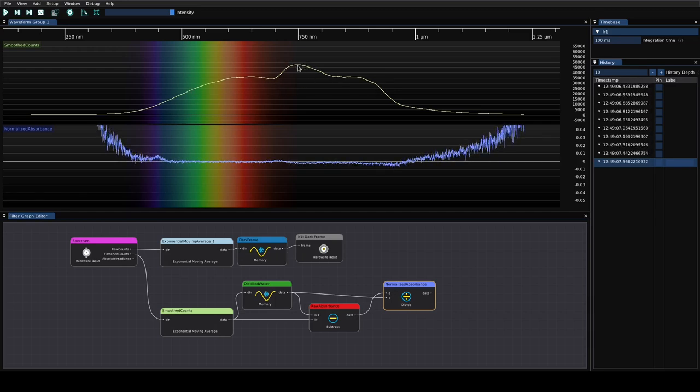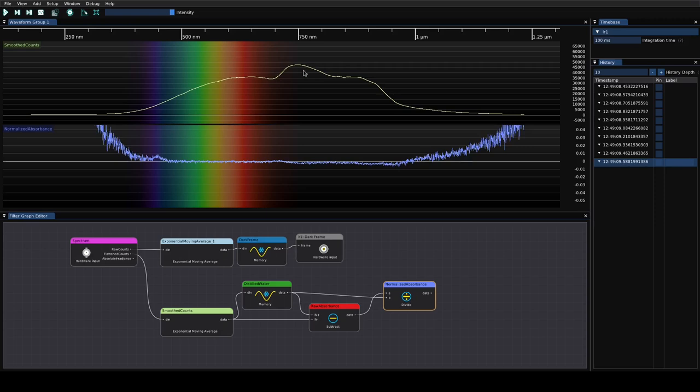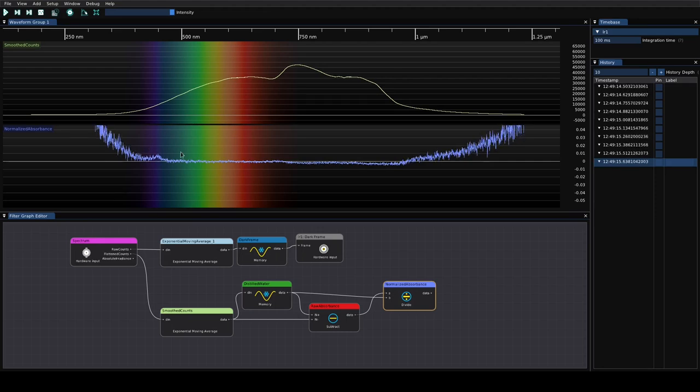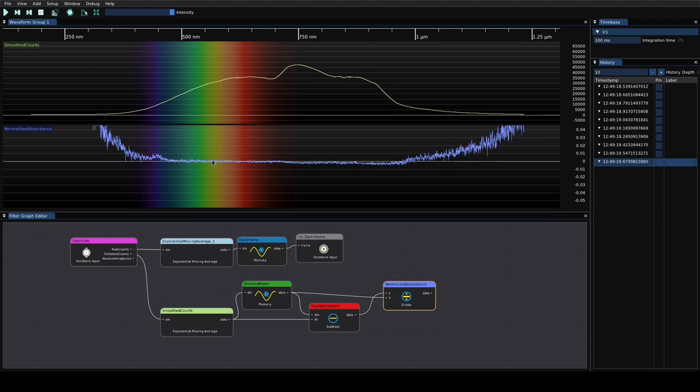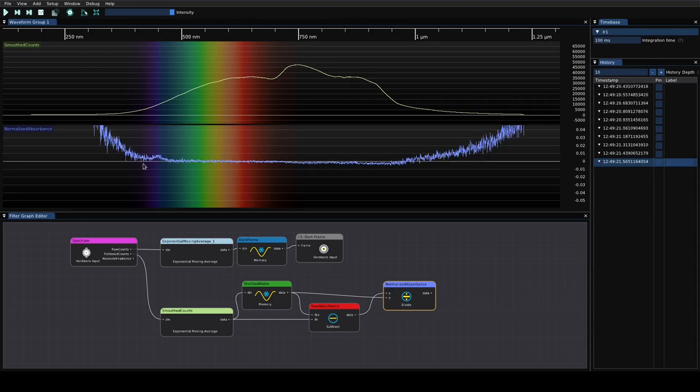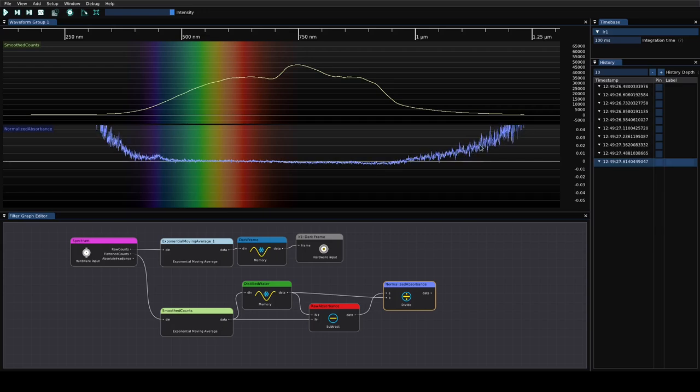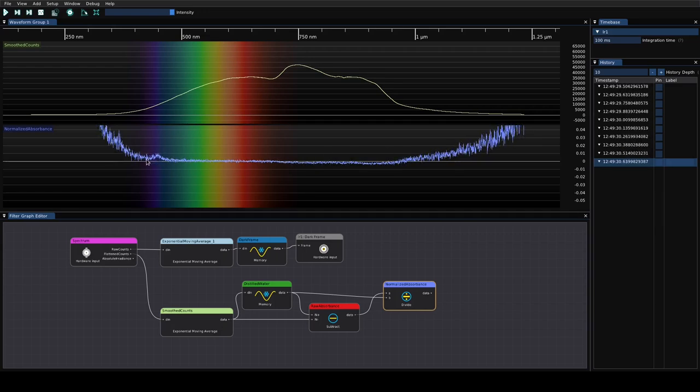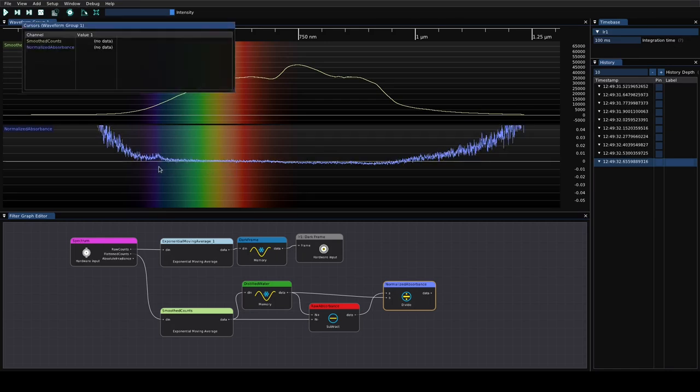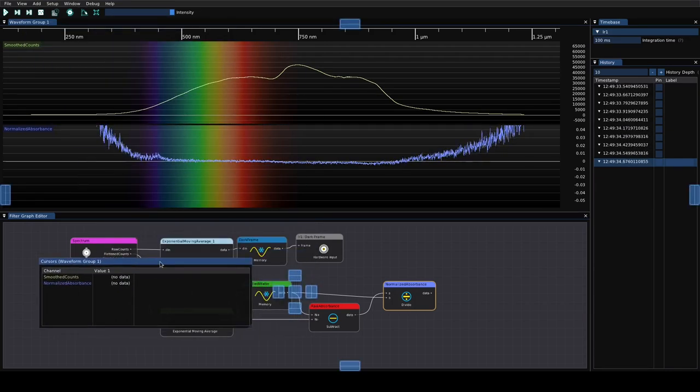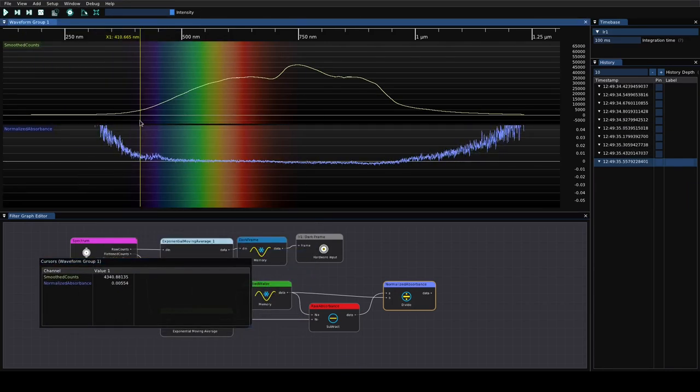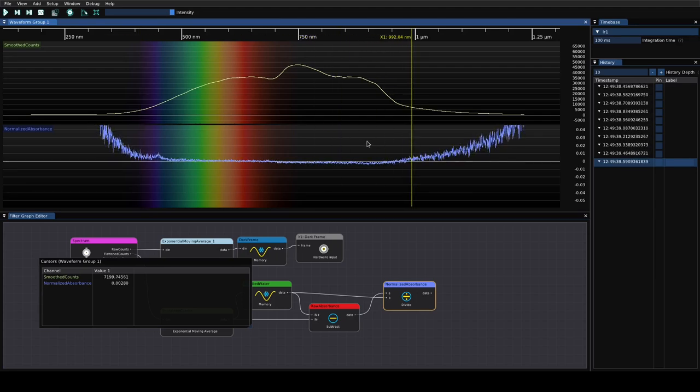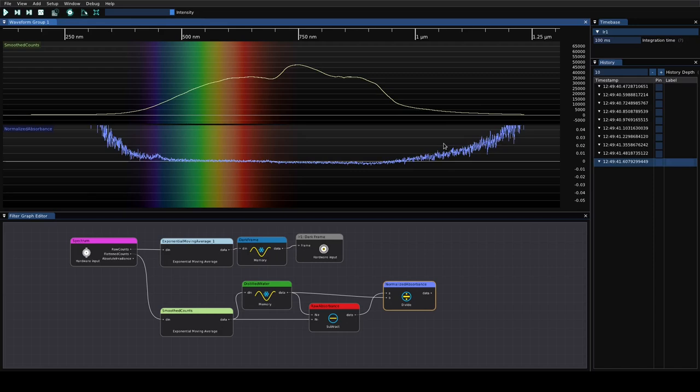Up here we've got the raw spectrum coming off of the spectrometer showing the emission spectrum of the halogen lamp. You can see we've got the big peak in the infrared around 759 nanometers, and then it tails off towards the visible and the UV as well as the deep infrared. The SNR does get worse as you get deeper to the UV and the infrared because we just don't have enough counts to get good data.